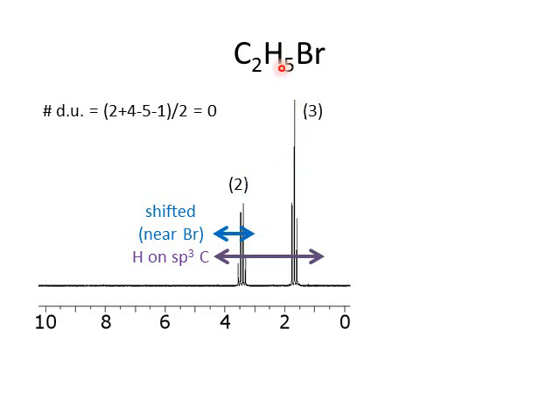I have a total of 5 hydrogens. So that means that this signal tells me about 2 hydrogens, and this signal tells me about 3 hydrogens. So essentially I have a CH2 and a CH3. Now, I should step aside and note that that's not necessarily true.